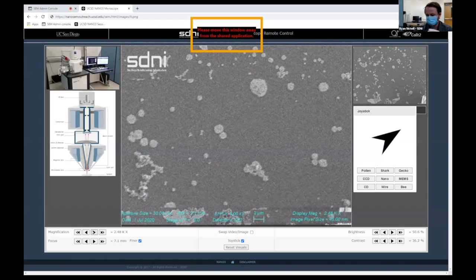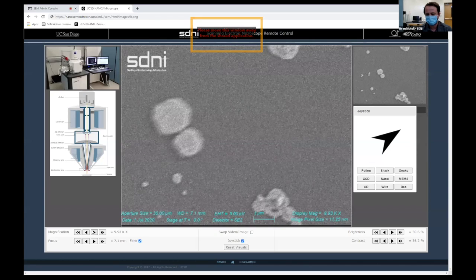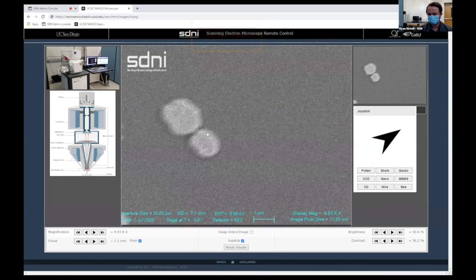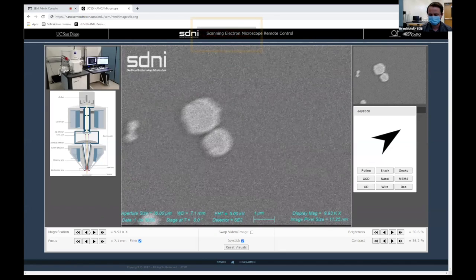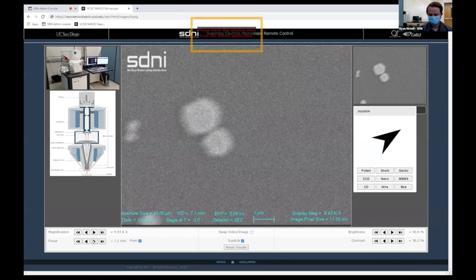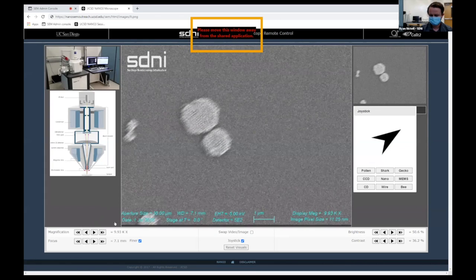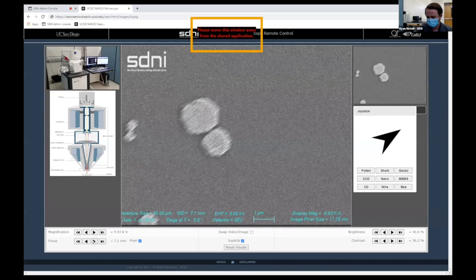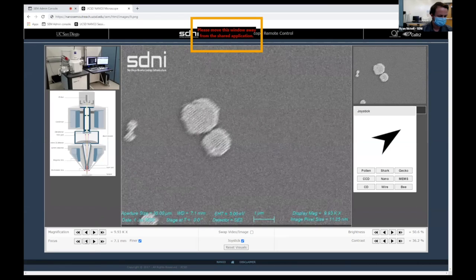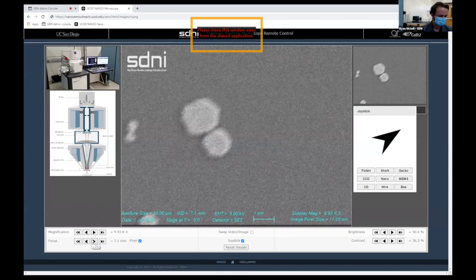So you're almost there. If you keep zooming in, those white blobs are actually groups of nanoparticles. That's not one nanoparticle. So keep focusing. And there's some extra settings that I might have to help you with, but if you keep focusing, you should get there. This is amazing. It's almost like a race. Oh, you're starting to see the sort of contrast in the middle there? You're starting to get a hint of them. Go back. So I think your focusing is close, but not perfect. Yeah, I'm bouncing around it.